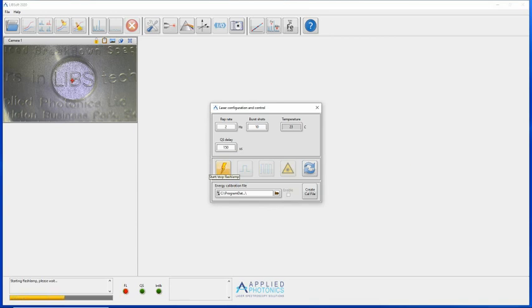Note that this reset procedure doesn't actually start either the flash lamp or Q switch, it simply returns the laser to a state such that they can be started either manually, as we've just done, or by initiating an acquisition. With the Quantel Q-Smart laser, this reset procedure needs to be initiated manually.